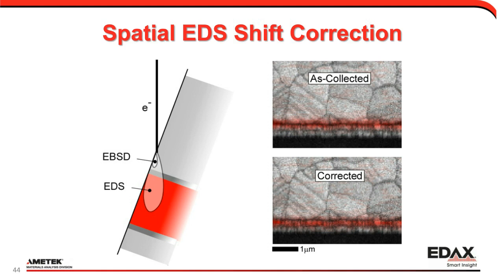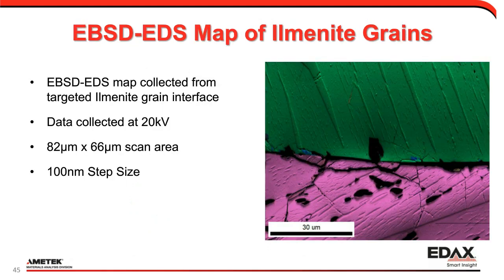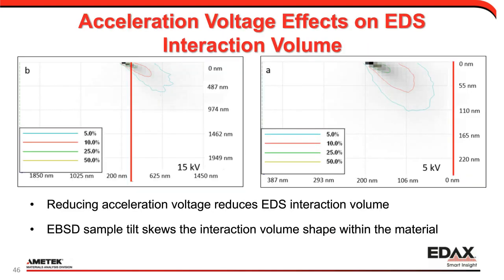phase problems. And that's kind of the reason I talk about that, because that's what we can go back to with these ilmenite grains, where I can go closer and look at a smaller area with 100 nanometer step sizes to try to resolve some of these very fine features we see within these little striations. But again, we know that at the voltages we're using, when we're having these different phases within the same orientation, we'll get chemistry coming from across the boundary.